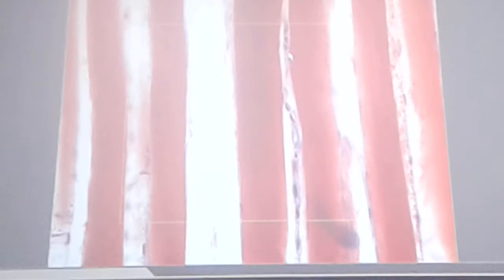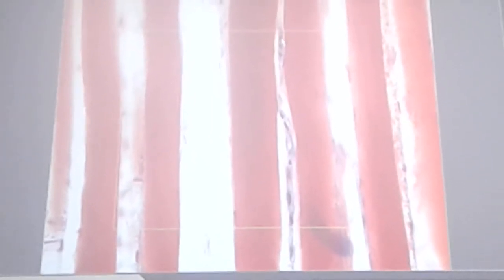Okay? So in this striated muscle type, all you have to know is that the striated muscle fiber has striations, as you can see here. The nuclei are located in the periphery of the fiber, and striated muscle fibers have multiple nuclei, okay?